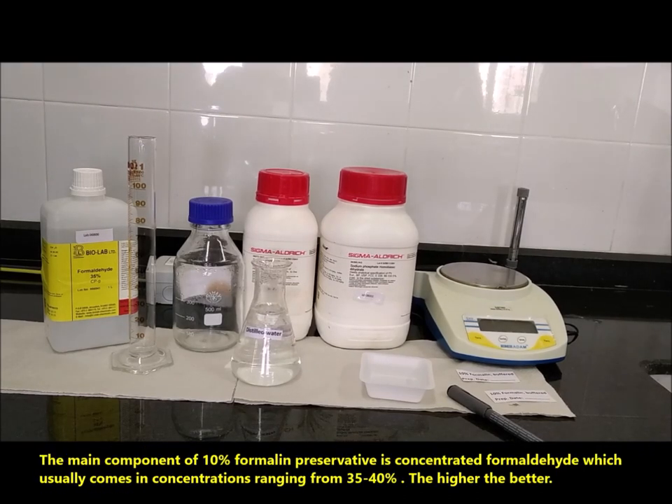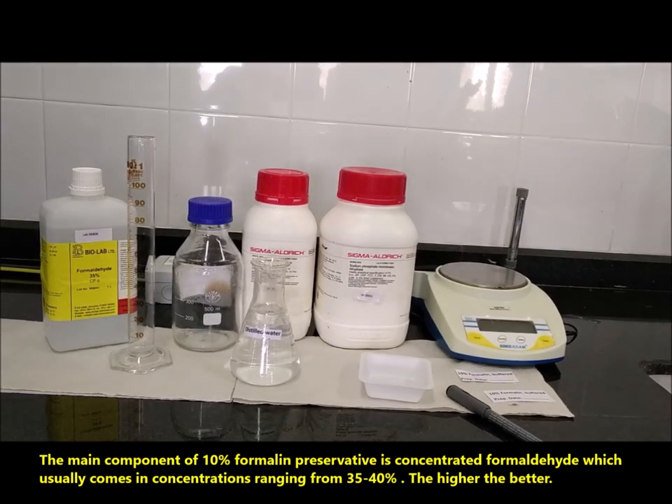The main component of 10% formalin preservative is concentrated formaldehyde, which usually comes in concentrations ranging from 35 to 40%. The higher, the better.